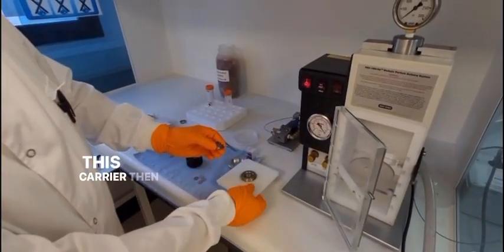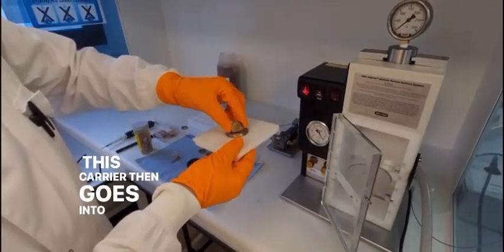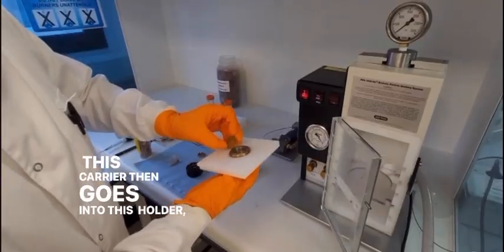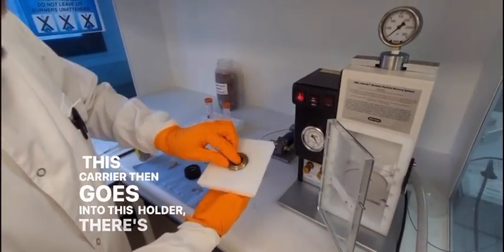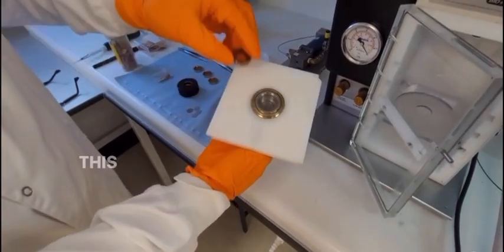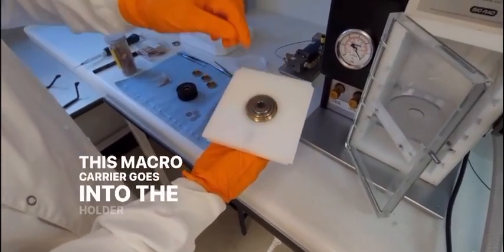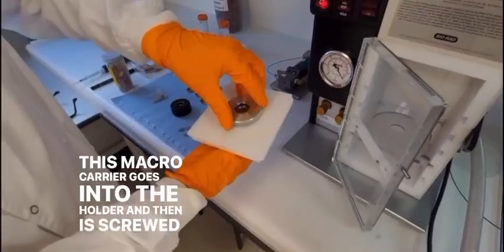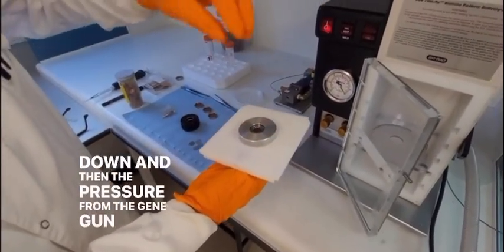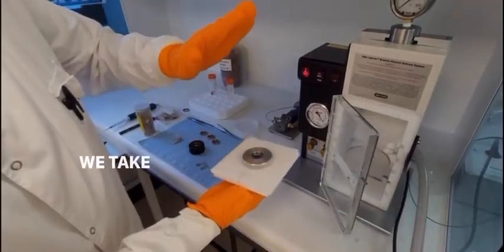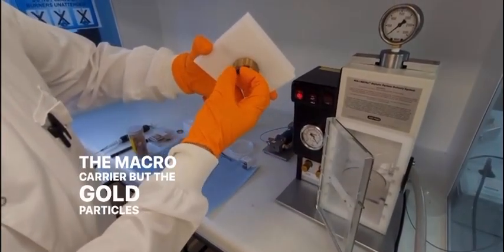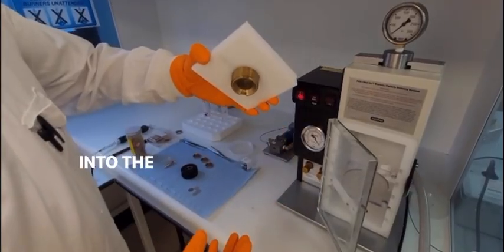This carrier then goes into this holder. There's a small stop screen in there. This macro carrier goes into the holder and is then screwed down and then the pressure from the gene gun will push down, take the macro carrier. The stop screen will actually stop the macro carrier but the gold particles will continue on and into the plant material.